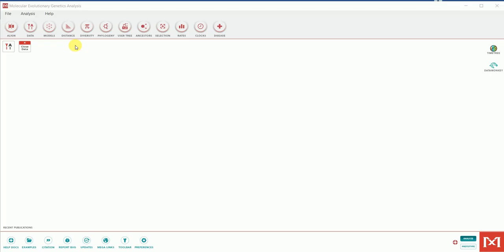I have already opened my MEGA 11 software. You just need to open it — nothing difficult. To perform phylogenetic analysis using this software, you first need to create the alignment. This is really important. To create an alignment, you click on 'Align' and then 'Edit or Build Alignment.'